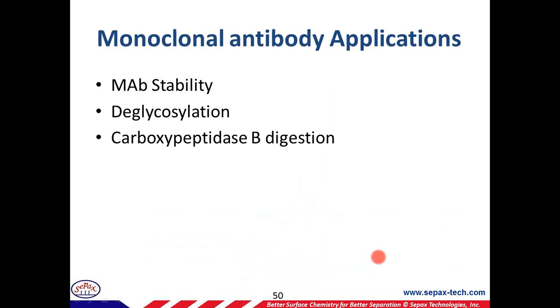So we have talked about a lot of methods, a lot of buffer systems used on our ABX and SCX. Next, we want to talk about monoclonal antibody applications. We use those methods for the monoclonal antibody separation.